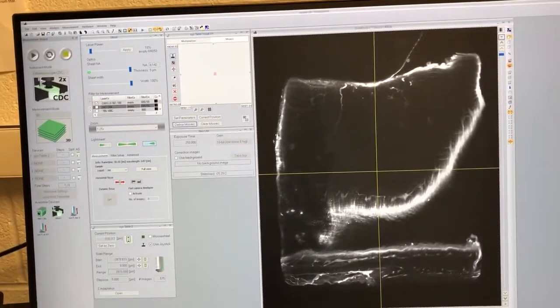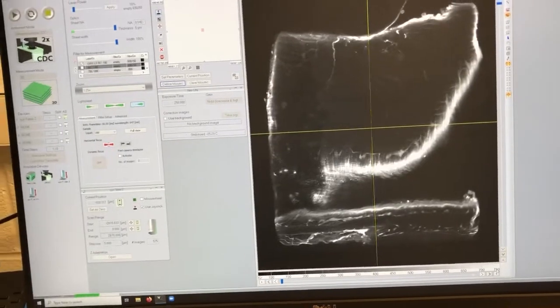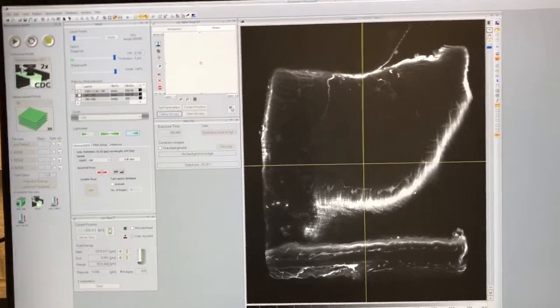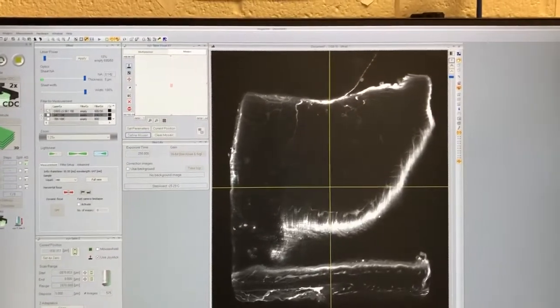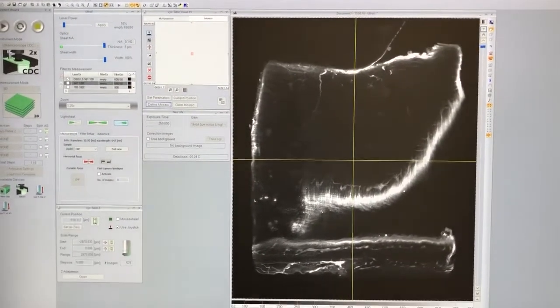Once you've made that decision, something you can do is adjust the width. If you've zoomed in a lot, you can narrow the width to get more power into your sample without sacrificing evenness of illumination.